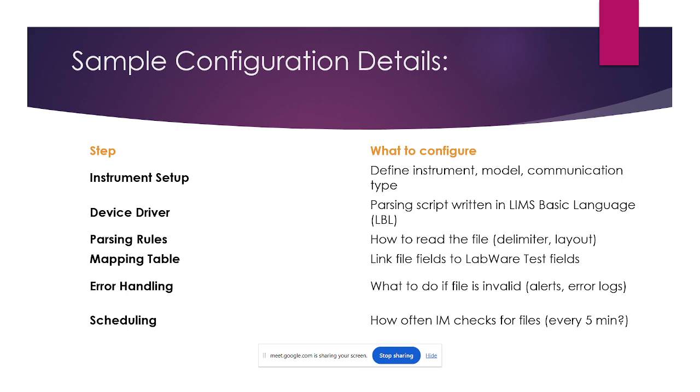After the server is running, samples will automatically generate in the LIMS application. For example, the EM module, environmental monitoring, should generate samples every day. Once you fix the schedule time, like every 24 hours, the LIMS application will automatically generate the samples. So if you create that schedule, samples will generate automatically.